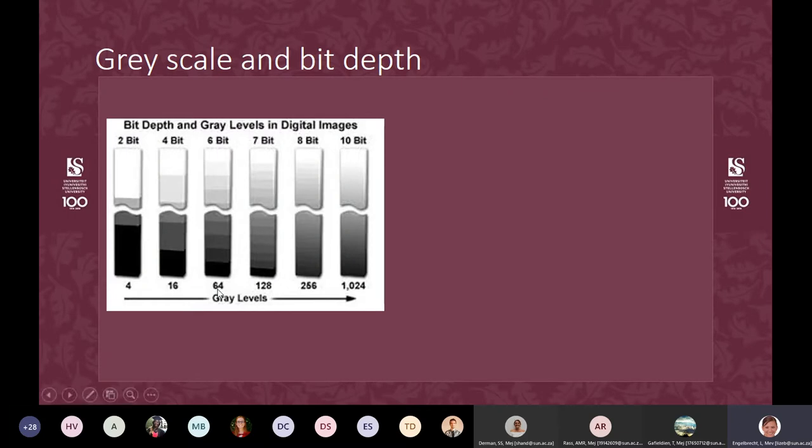64 grayscale levels. Now, with 64 levels you can distinguish things, but in fluorescence microscopy, we need to distinguish very, very small differences. For example, you are treating your cells with some stress inducer, and then the reactive oxygen species increase slightly. You need to be able to measure that increase. And sometimes if you have increments that are this wide, a little difference between one treatment and another treatment might not actually show you any changes. Therefore, the camera has to have a higher bit depth.